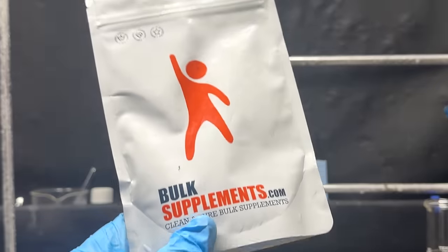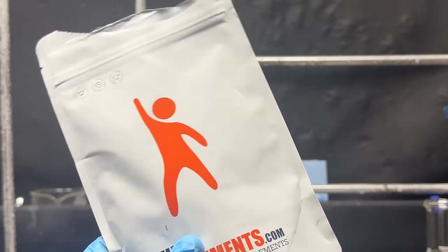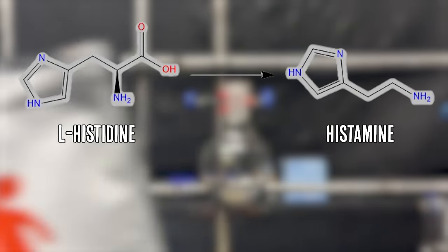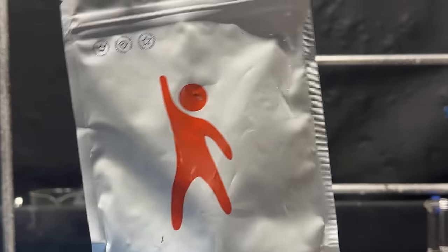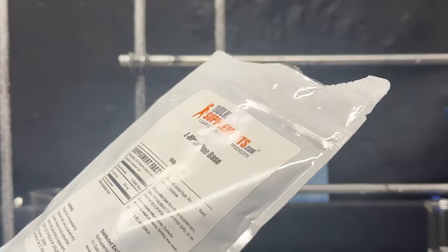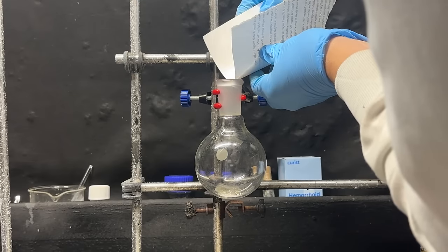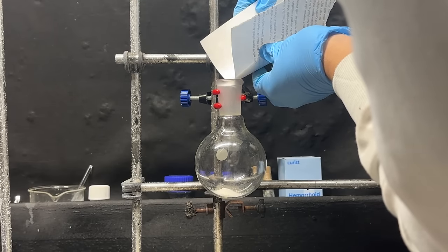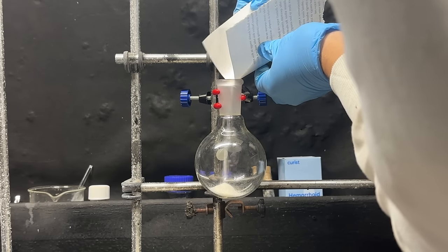To make our histamine we're going to start with L-histidine. This is essentially just an amino acid, and if it's decarboxylated it will turn into histamine — you can see how similar the molecules are. This is going to be our starting material because it's extremely cheap and a fairly easy conversion. To this 250 mL round-bottom flask I'm going to start off by adding 20 grams of our L-histidine, which is a nice white crystalline powder.